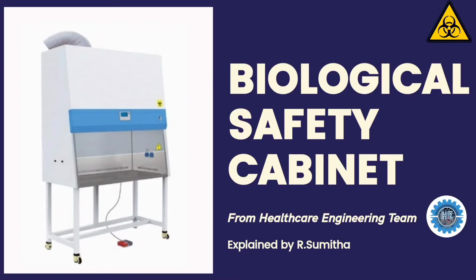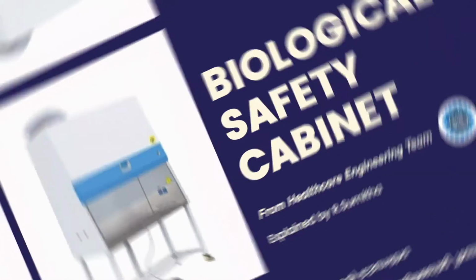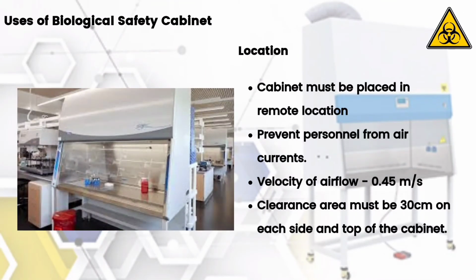Welcome to part 3 video of Biological Safety Cabinet. If you missed our part 1 and part 2 videos of Biosafety Cabinet, please watch them soon. In part 3, we are going to start with uses of Biological Safety Cabinet in laboratory. The first usage is in location.